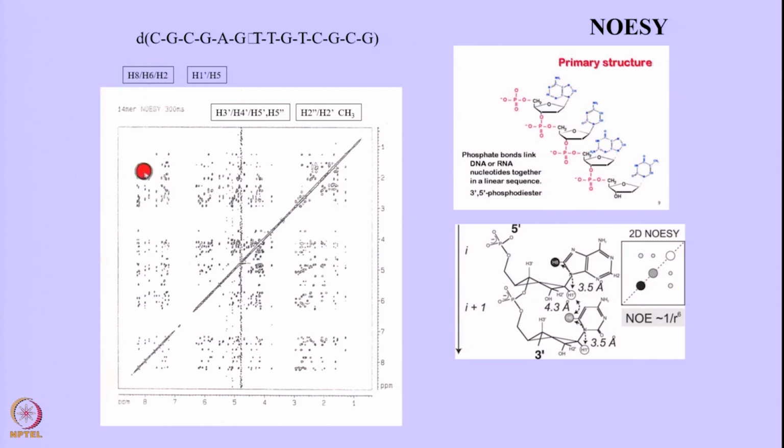All of these are base protons, and then you have here, very characteristically, the thymines. So, these are the NOEs from the methyls of the thymines to their own H6 protons. There are 3 of them here, you can see them very strongly, and therefore this fixes the positions of the thymines here. So, everything you do should be consistent with that.